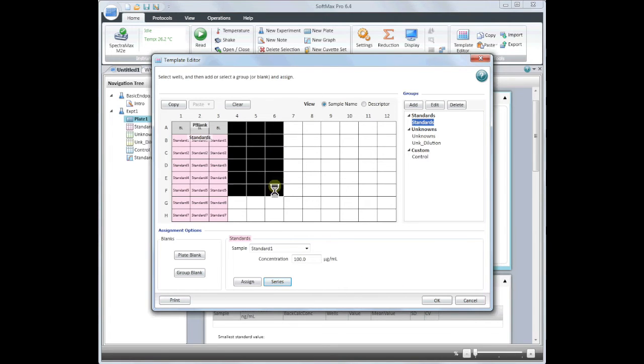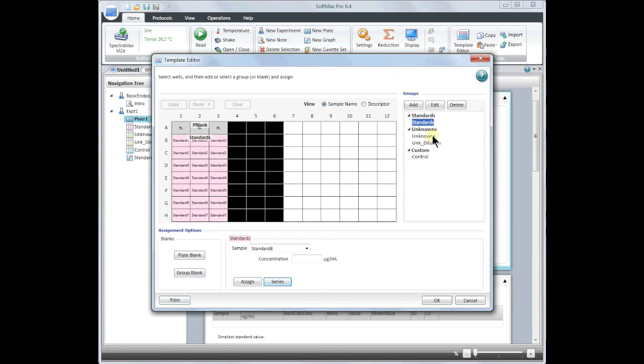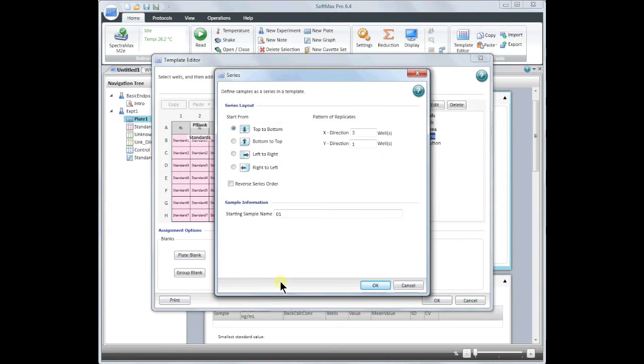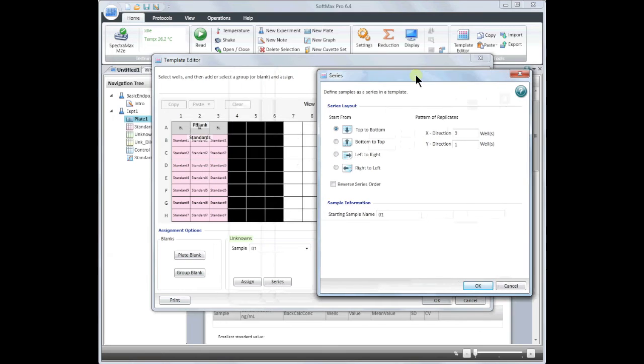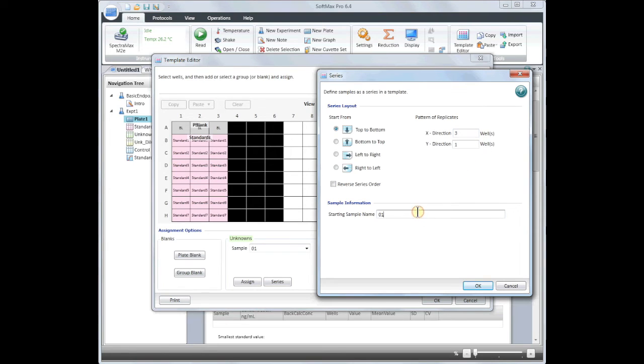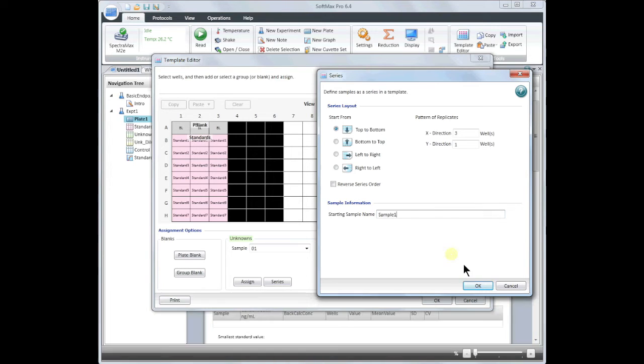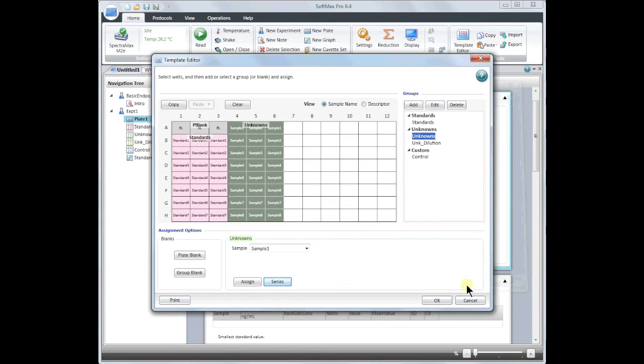Next, I will set up a series of unknowns. You can have unknowns without dilution factors or with dilution factors. In this example, I will show you without. Click on unknowns and then click on series. My samples will be in replicates of three, so make sure that the pattern of replicates is set correctly and then assign your starting sample name. When you are finished with your template, click OK.